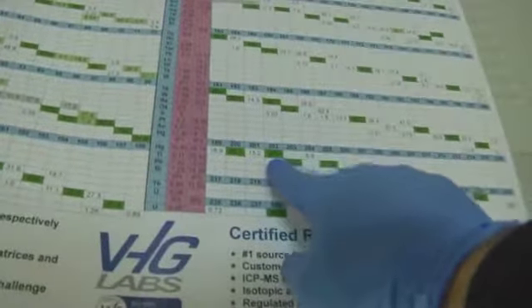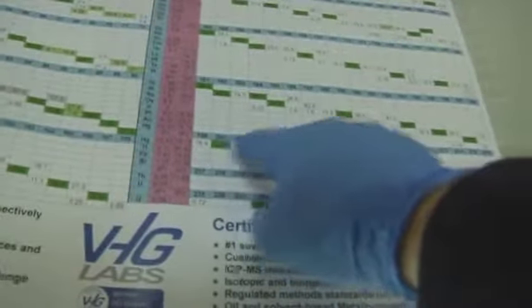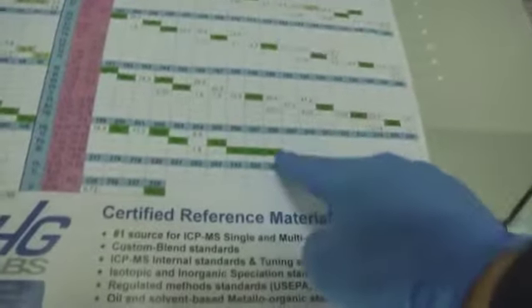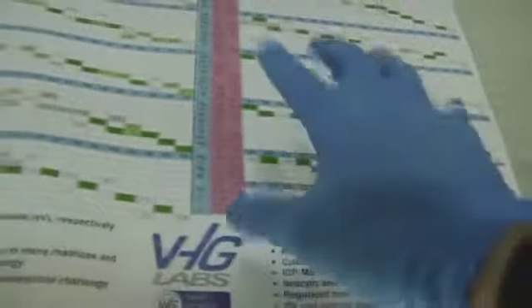I always look for multiple isotopes in the ICP-MS data analyzer report. So I see 200, 201, and 202. For example, when I'm looking at lead here, I'm looking at 206, 207, and 208. As you see, lead, right? Right there. I'm not just looking at one of them. I'm not just looking at 208. I'm looking at all three to make sure that they line up. And when I saw something curious here in mercury that did not line up, I knew I was onto something interesting. That's how I discovered tungsten in rice protein.